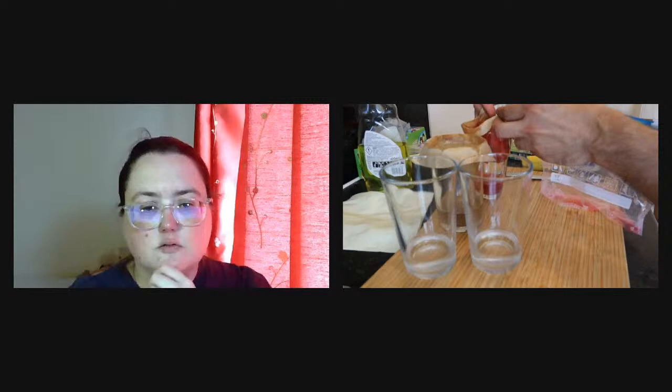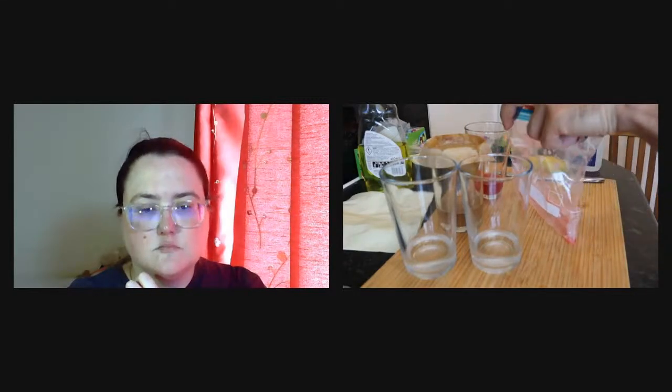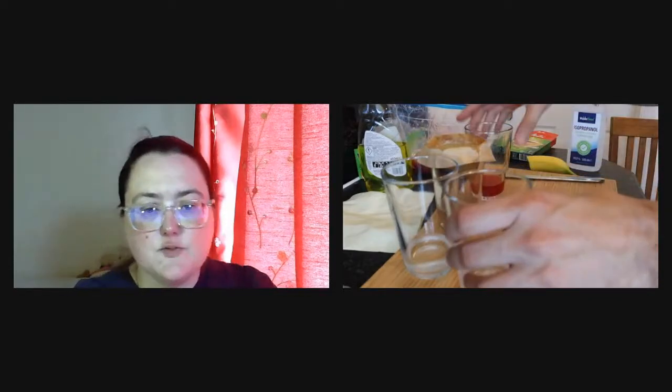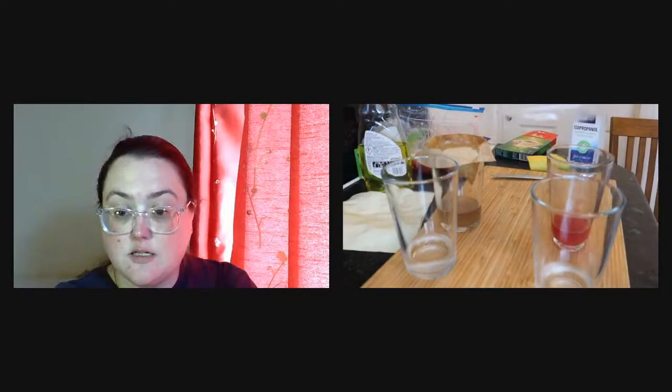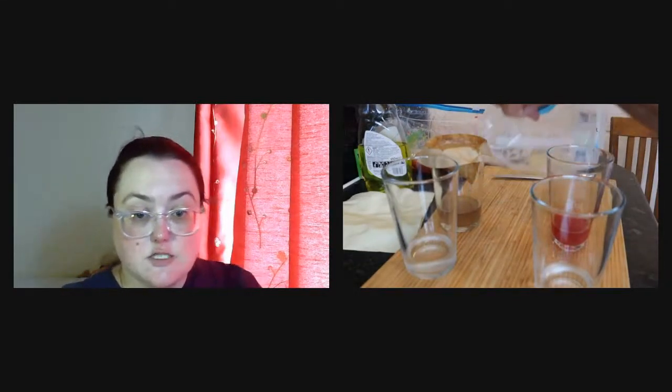Try not to break the filter and try not to put anything inside the glass. This way it will be good. So everything that Remy's using today can either be recycled or thrown away in the trash. There is nothing that needs any special disposal.